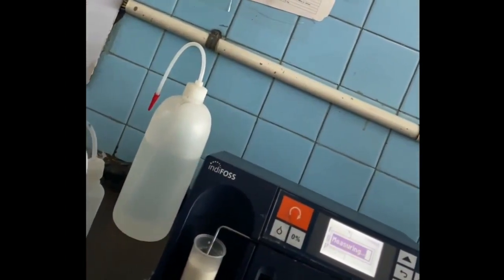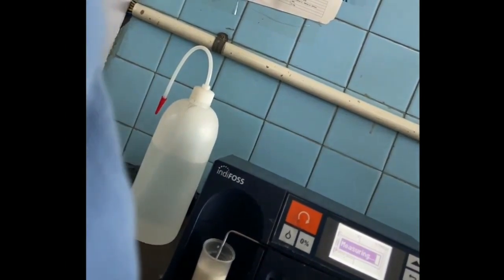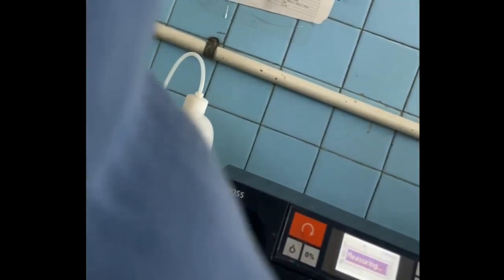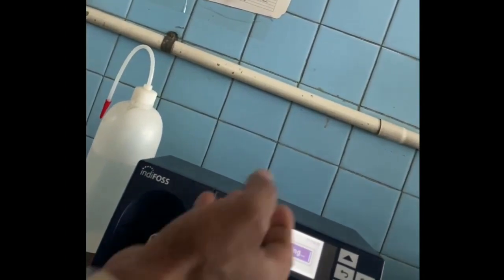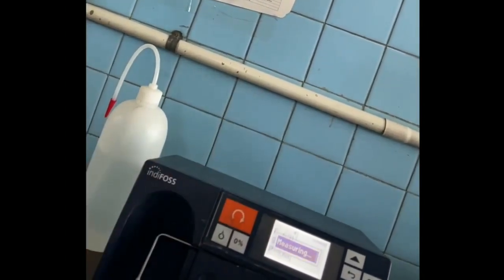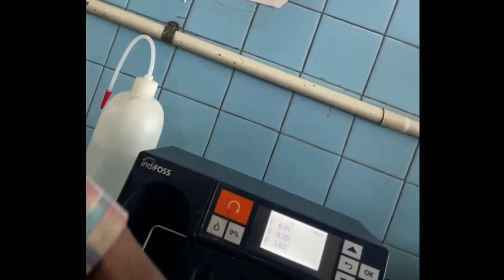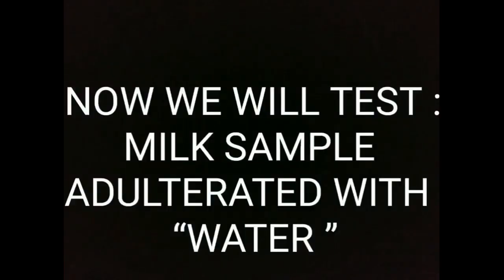The measuring is almost completed. Here are the results — you can see the fat value, and no adulterant is present.